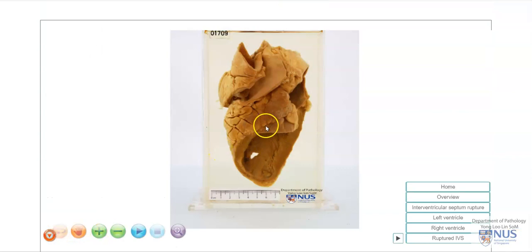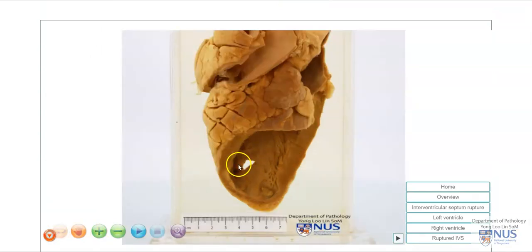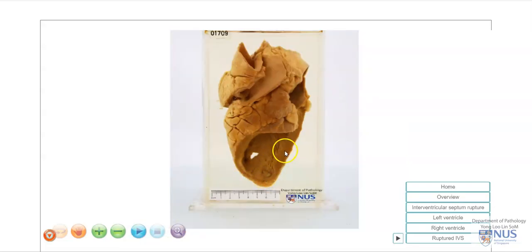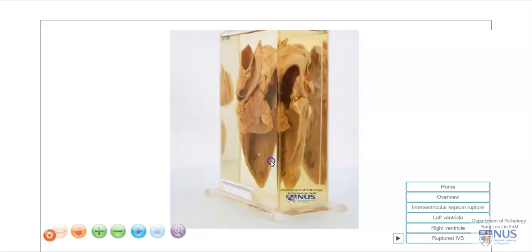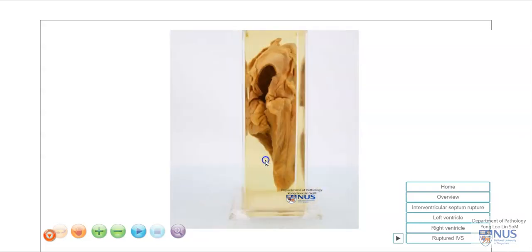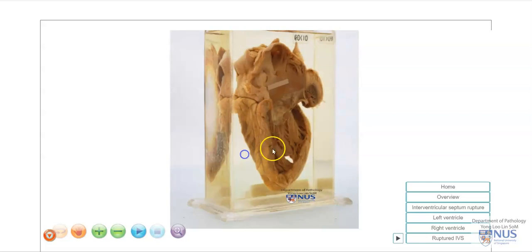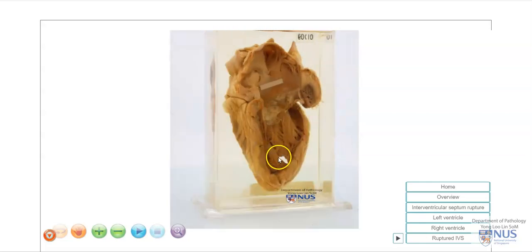In summary, here we are looking at an example of ruptured interventricular septum, secondary to myocardial infarction, and this defect is full thickness in the septum joining the left and the right ventricles. This leads to left to right shunting, and eventually can give rise to congestive heart failure. Thank you.